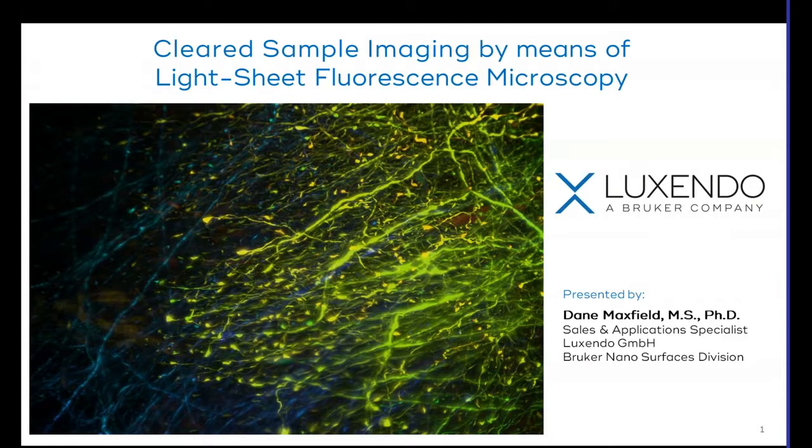Today, I'm going to be speaking to you about cleared tissue imaging with lightsheet fluorescence microscopy.